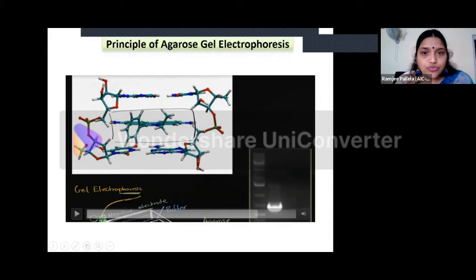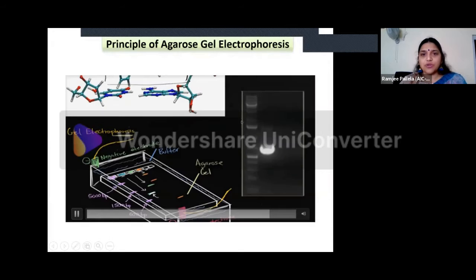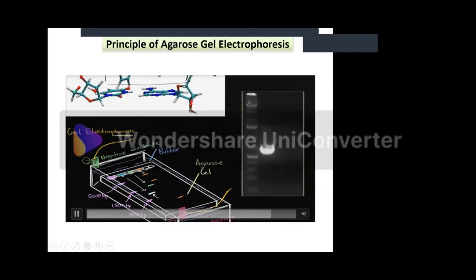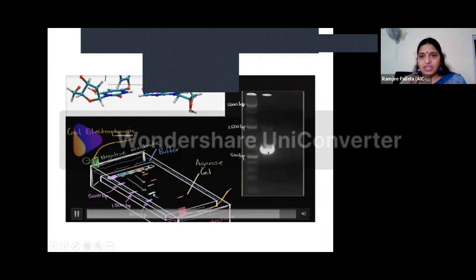Now these are the two strands of DNA. Okay, so it actually intercalates between the two strands of DNA. Once it intercalates, it means that it runs along with the DNA. It is capturing all the DNA with it. So then we will know that we are getting this fluorescence because of ethidium bromide. And this is the actual ladder. You can see here different bands, right? These different bands are because of the different sizes of the DNA fragments. And this particular band is coming somewhere near 500 to 600, 500 to 700. So it will be around 650 or 680 in its length.